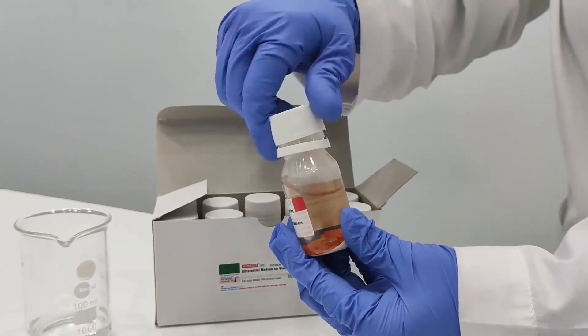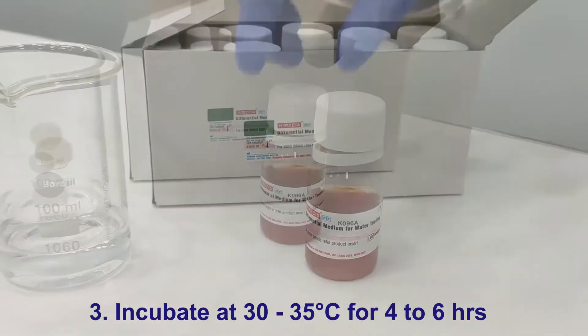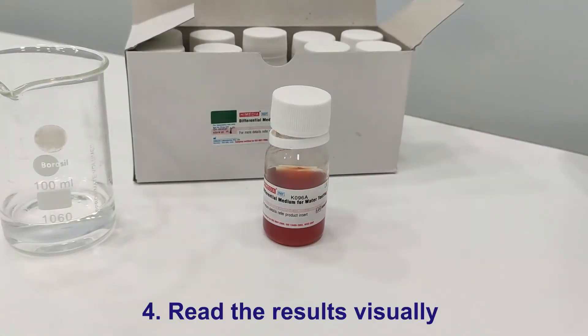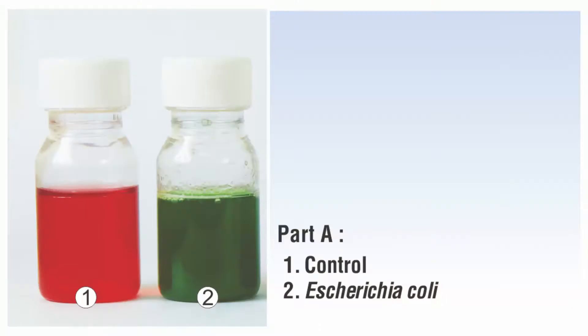Mix the contents until dissolved. Incubate at 30 to 35 degrees Celsius for 6 hours. In case of incubation at lower temperatures, the time can be exceeded beyond 6 hours.